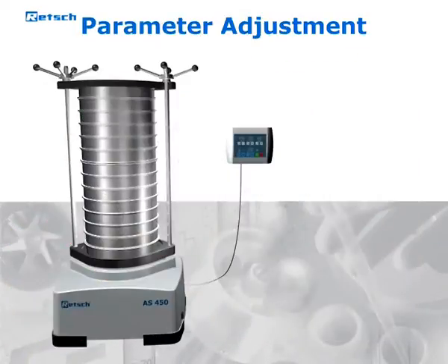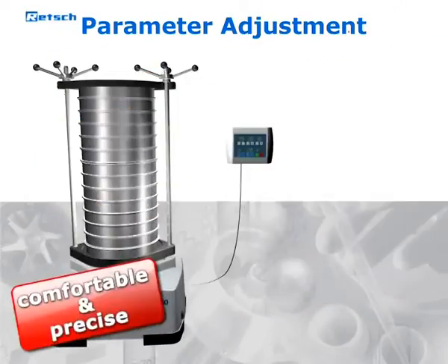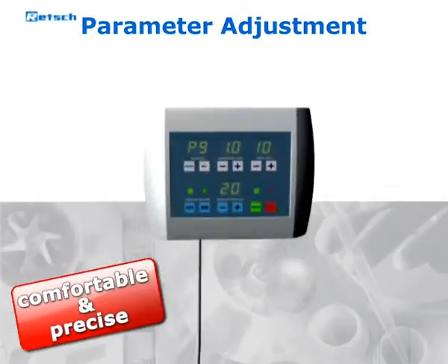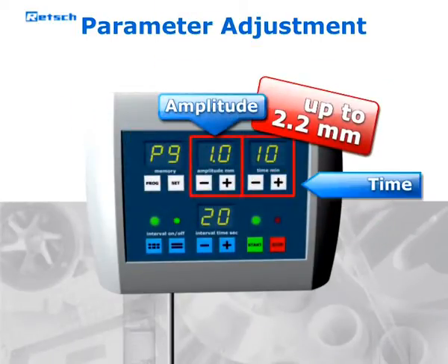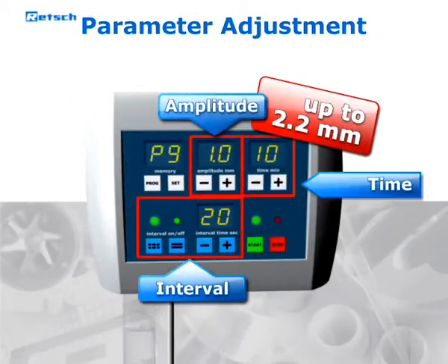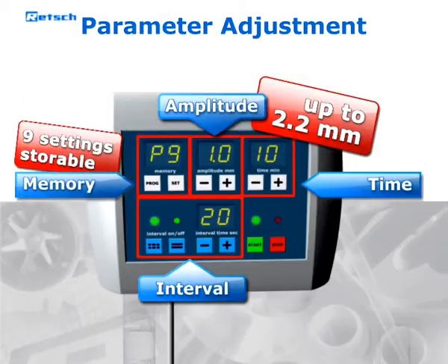The mobile operation panel ensures comfortable and precise handling. All sieving parameters such as amplitude, time and interval can be adjusted digitally. Additionally, 9 parameter settings can be stored for routine sieving processes.